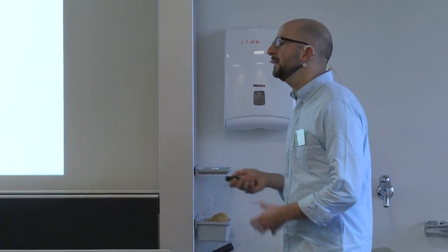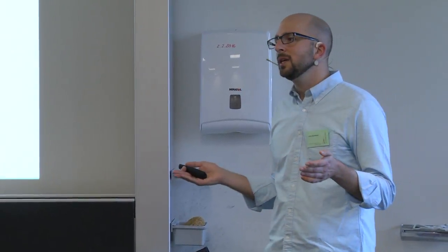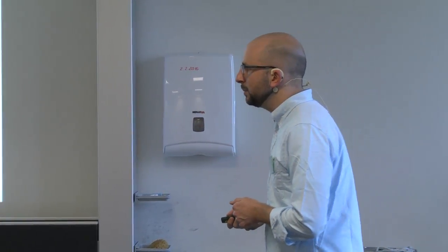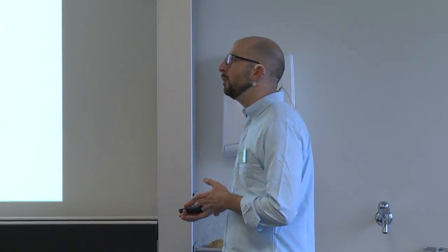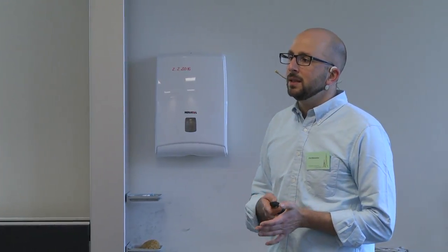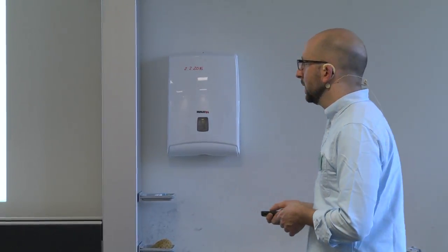We would recommend using between 10 to 20 peptides that cover the whole retention time range, so you don't want all of them at the beginning or at the end, because you would like a prediction that is as accurate as possible. They should of course be of high quality and abundance in all samples. This can be a set of peptides that is endogenous or spiked in, so maybe you've already ordered a set of peptides and you would like to use them. That is of course acceptable.